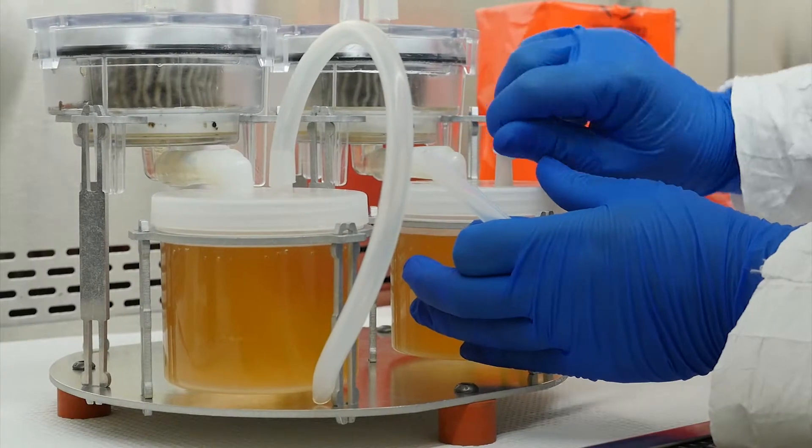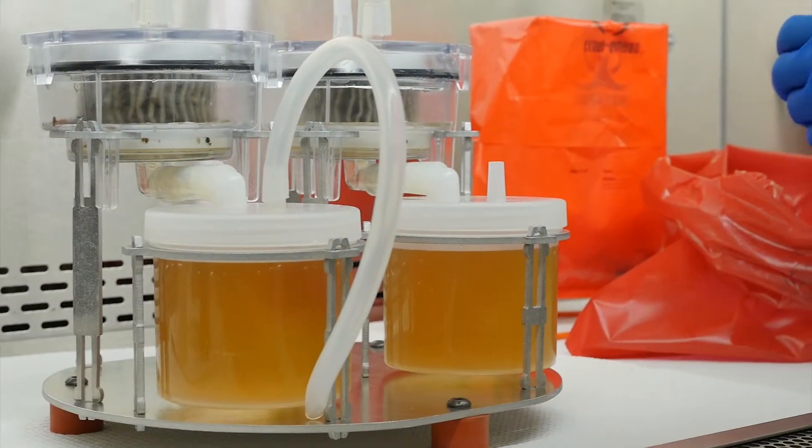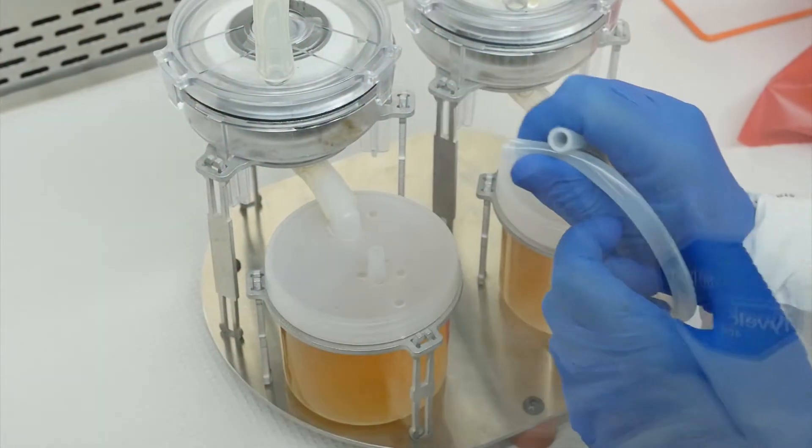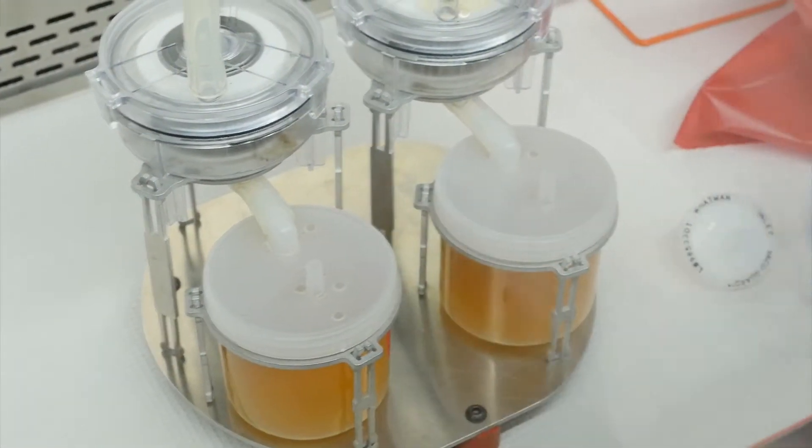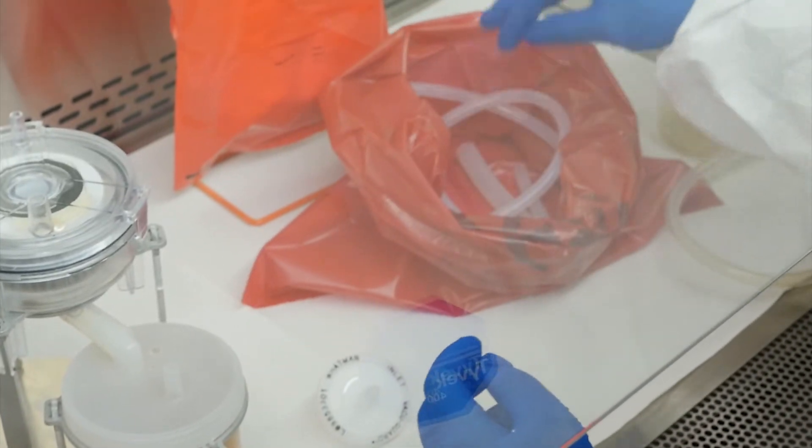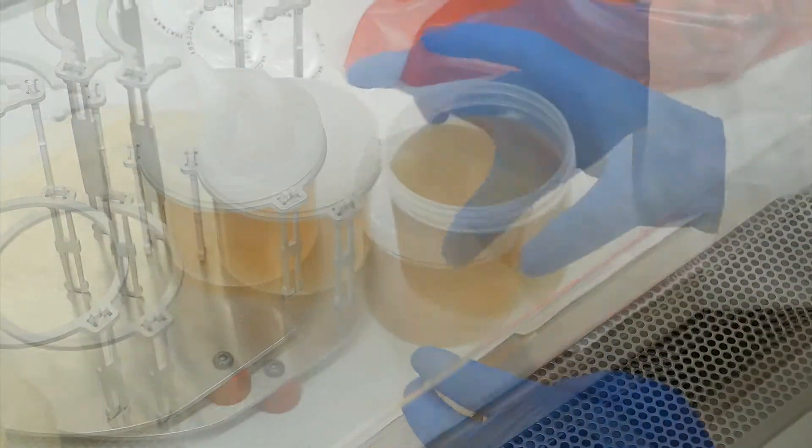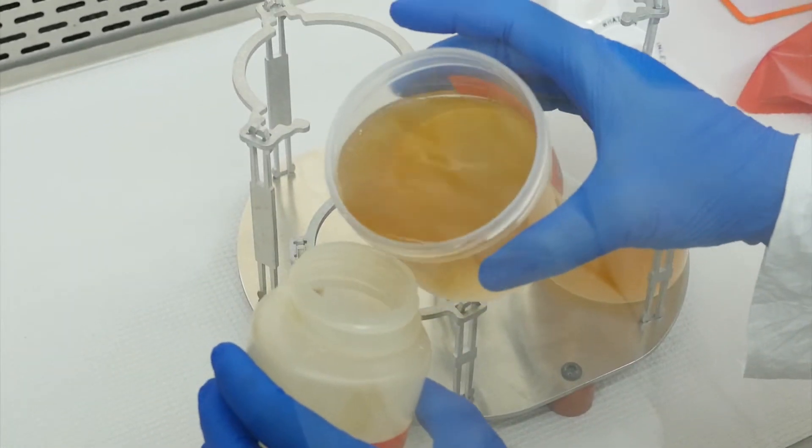After elution is complete, carefully detach all tubing from the ViroCap filter, collection cup, and bilge pump. Place the tubing in a bag to autoclave, then wash the tubing for reuse. Remove the collection cup lid and carefully pour the eluent into the labeled collection bottle.